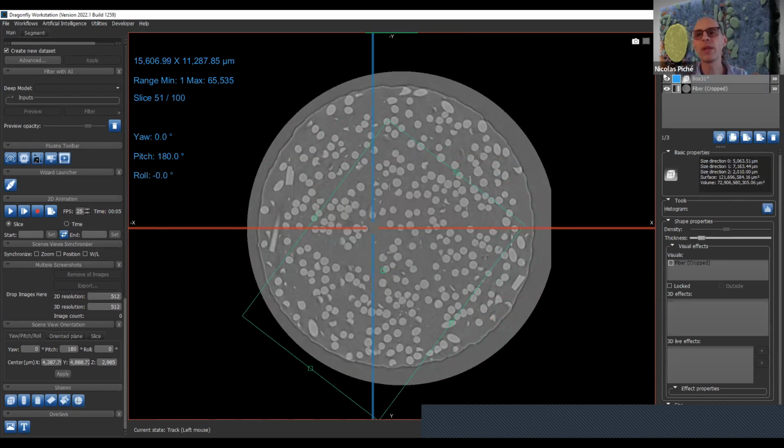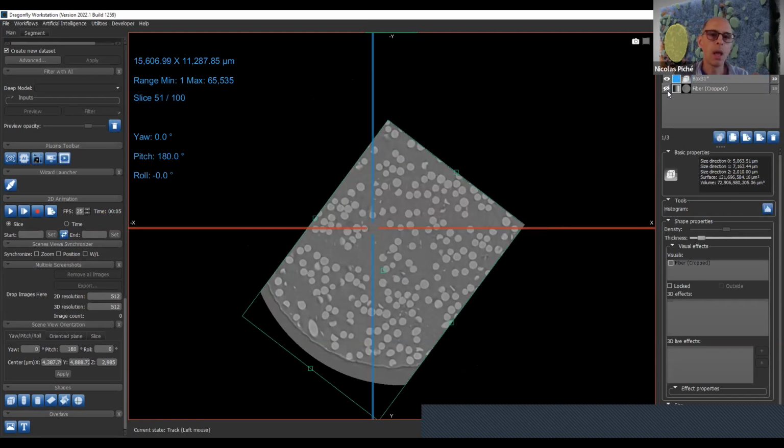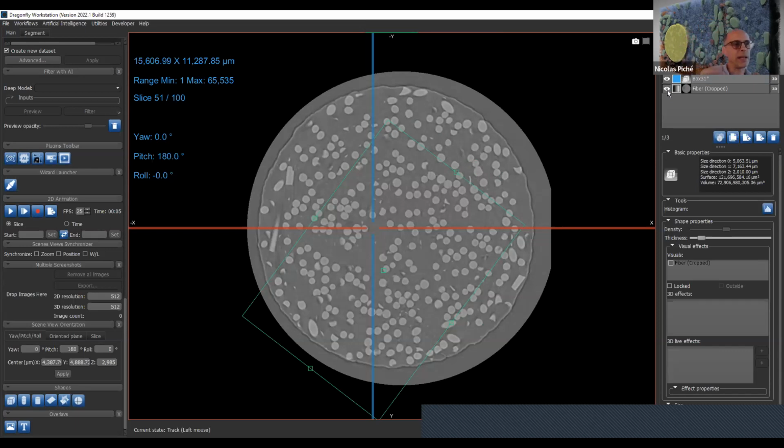So now I have a new data set that is exactly at the same position as the other. So if it's this one, okay? And that was positioned like that. So you can position yourself in any oblique, any position, and put the box and derive a series.